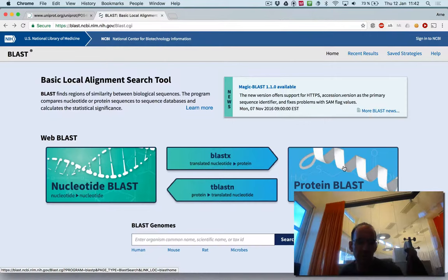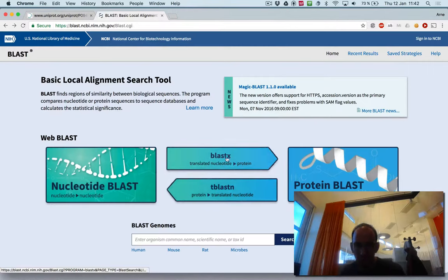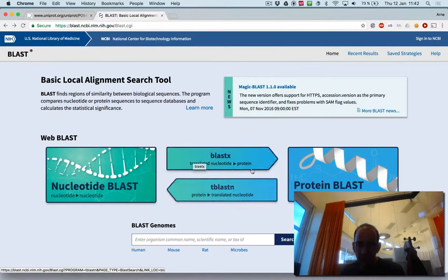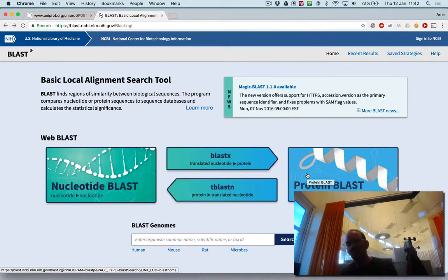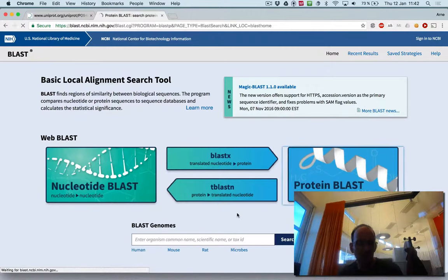First you choose between Nucleotide BLAST or Protein BLAST, or if you want to use BLASTX or TBLASTN, meaning you use a nucleotide search against a protein database or the other way around. In this case we use Protein BLAST, so you click on that.